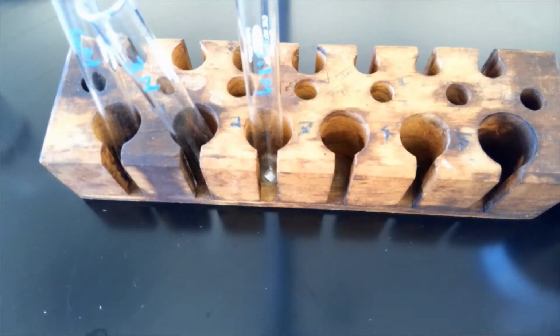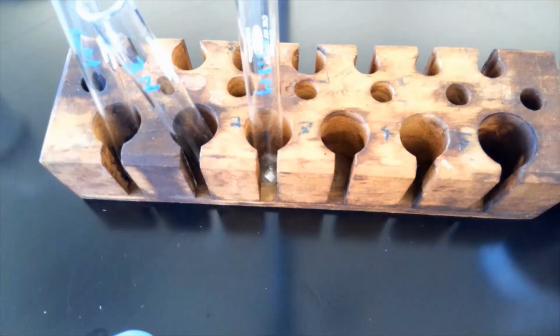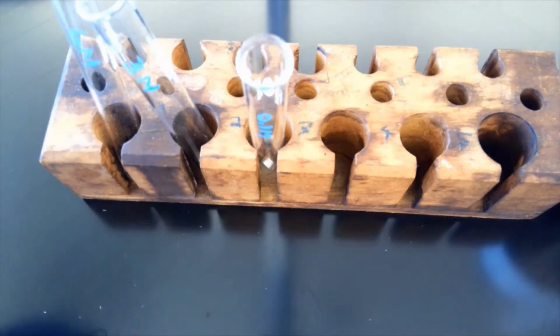In this part, we're going to compare the strength of the acids as they react. So we're going to compare 6 molar, 3 molar, and 0.1 molar. We're going to start off with acetic acid first. That's the weak acid. And we're going to react them with magnesium because that was the metal that was the most reactive that we've seen. So let's go and we'll start from highest to lowest.